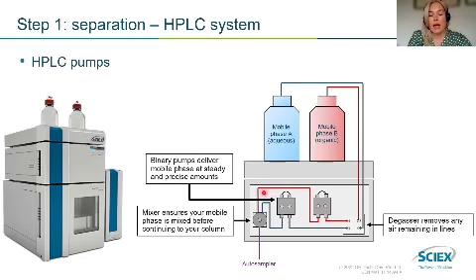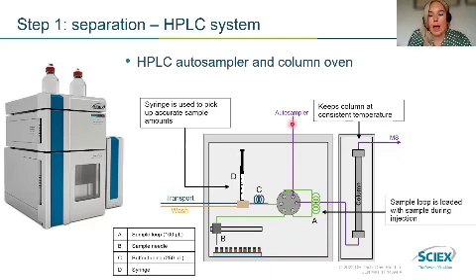We then get our LCMS flow to our mixer, and our mixer's main job is to ensure your mobile phase is mixed before continuing to our column. So if we just follow this purple line to our auto sampler, our LCMS flow then goes to here into our auto sampler, and here A is our sample loop, which is loaded with sample. It'll then pick up the sample and we get our flow of our mixture of what we want to analyse through our column to our MS.